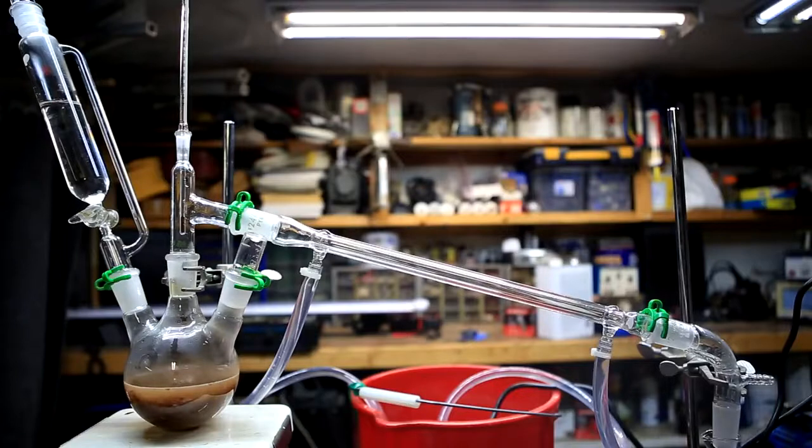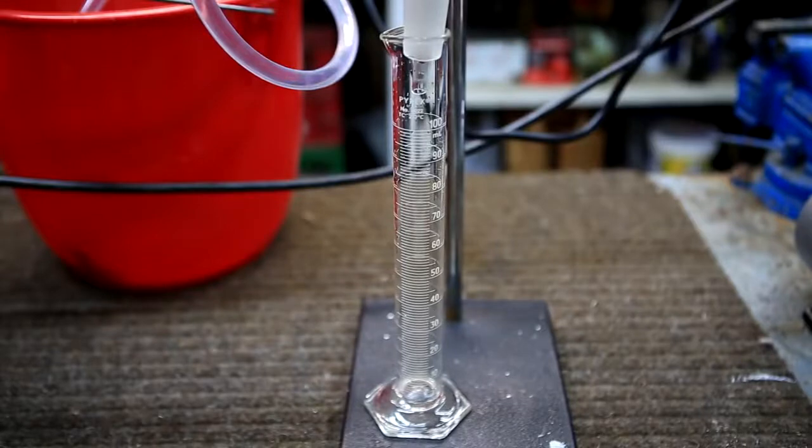The round bottom flask was then heated very lazily by directly touching it to a hot plate. I then placed a 100 milliliter graduated cylinder to catch the distillate.